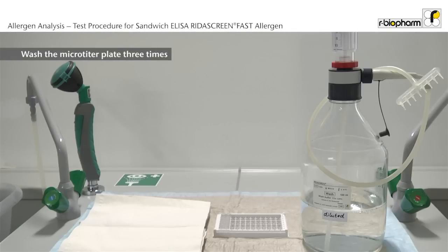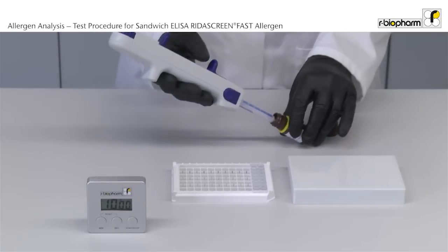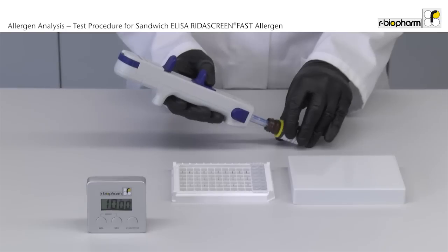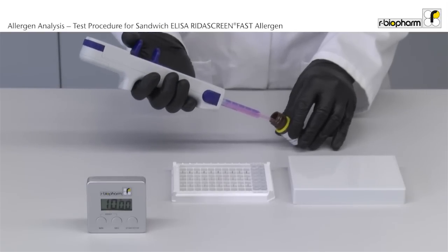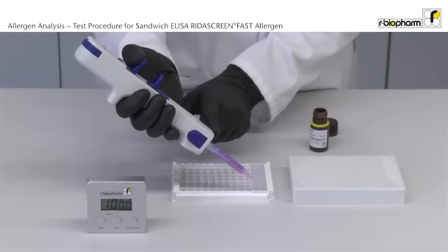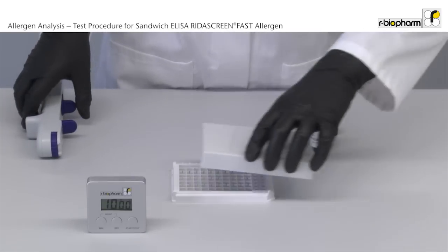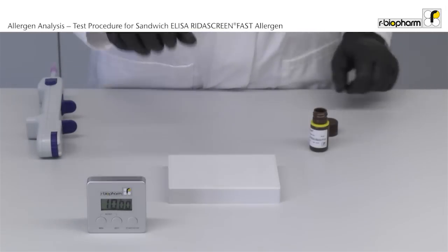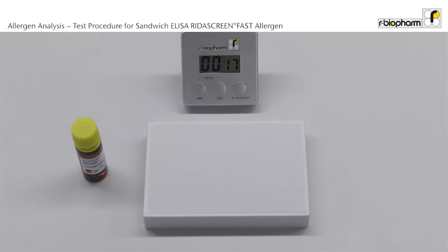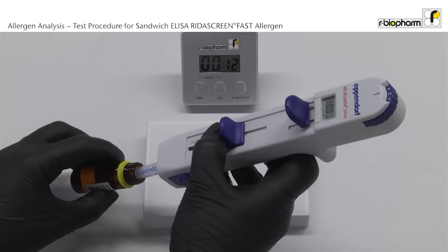After the incubation, the plate is washed three times. After washing three times, add 100 µL Red Chromagen Pro to each well with the multi-stepper. Incubate 10 minutes in the dark at room temperature. After the incubation, add 100 µL of stop solution to each well with the multi-stepper.